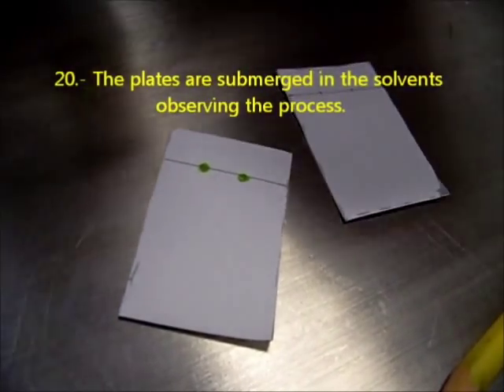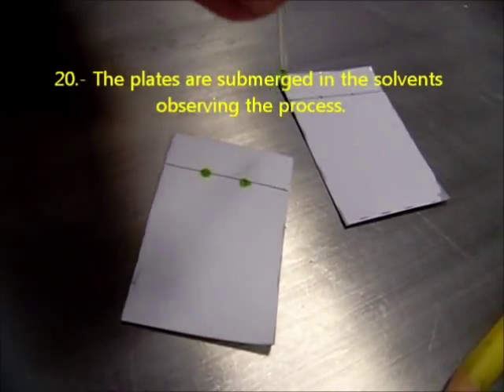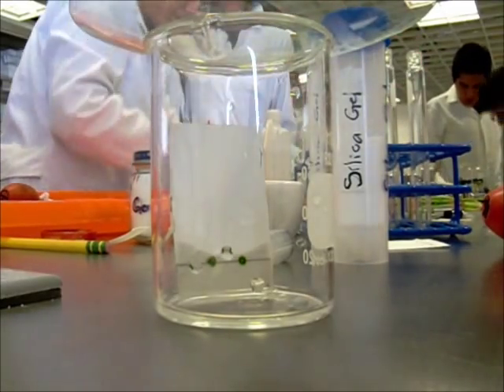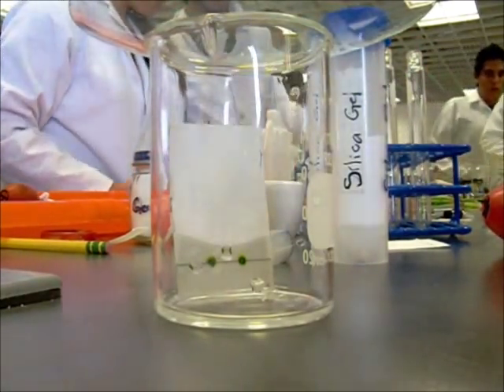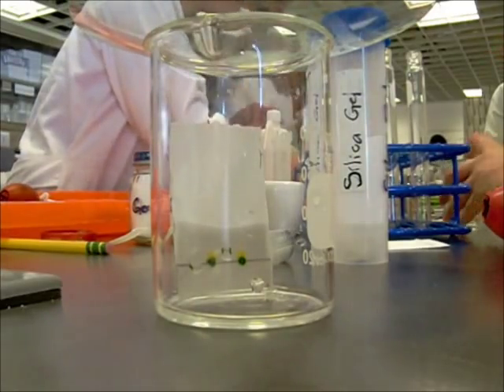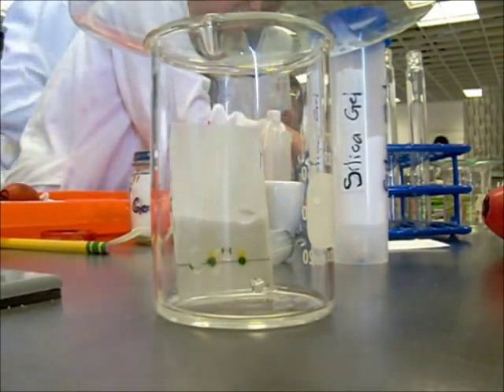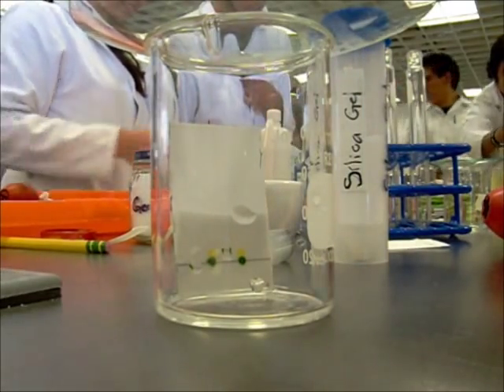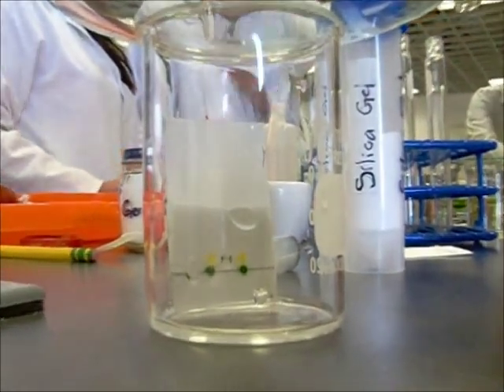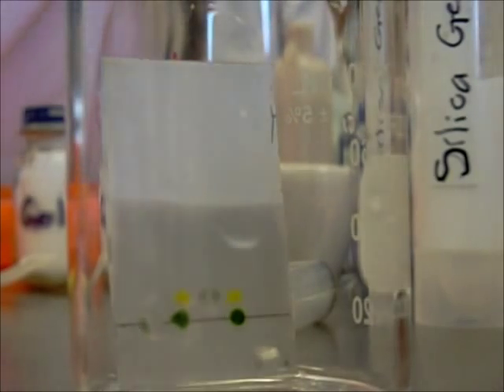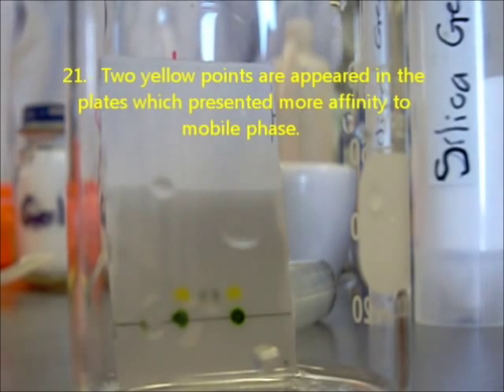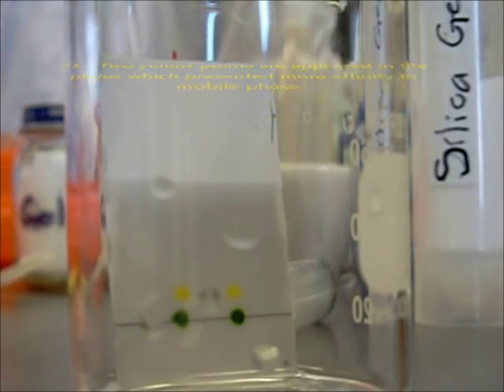The plates are submerged in the solvent, observing the process. Two yellow points appear in the plates which present more affinity to the mobile phase.